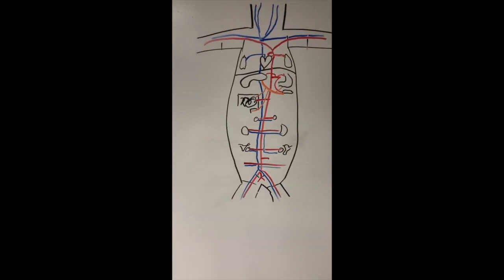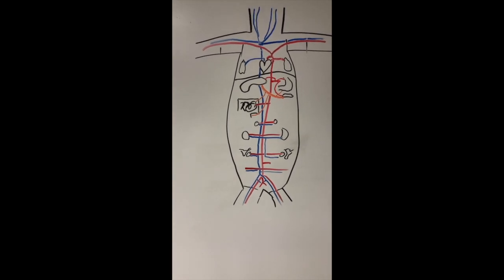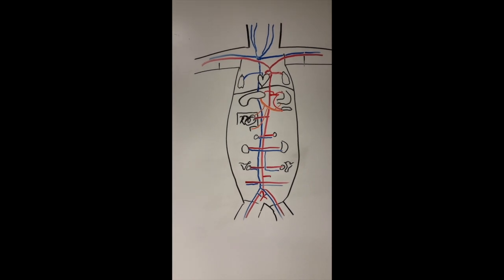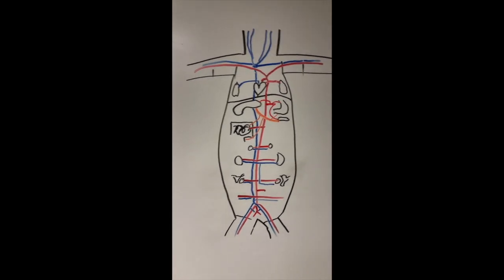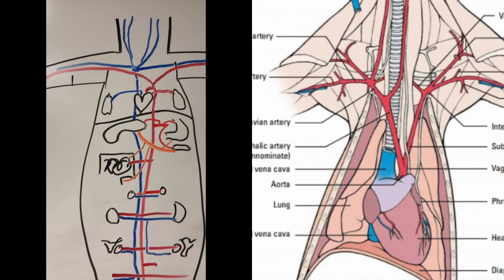So last but not least, let's talk about heading back up north past the diaphragm. You know what? We actually didn't address the arteries above the diaphragm. So we'll do that real quick.